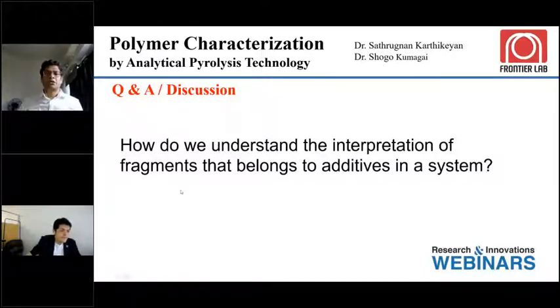Dr. Shogo, do you want to add anything on that? Yeah, so the temperature ranges should be separated: the thermal desorption for additives, and the temperature should be lower than the polymer pyrolysis. So that's, I think, the best way.